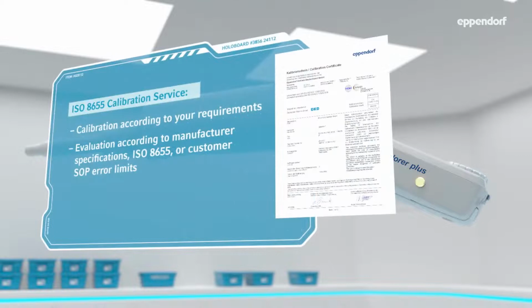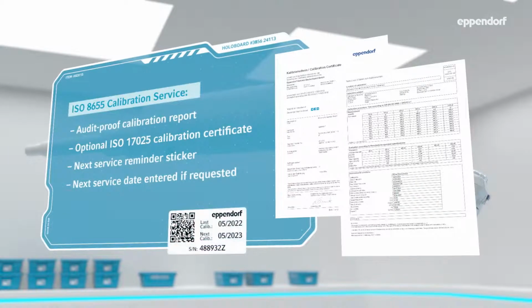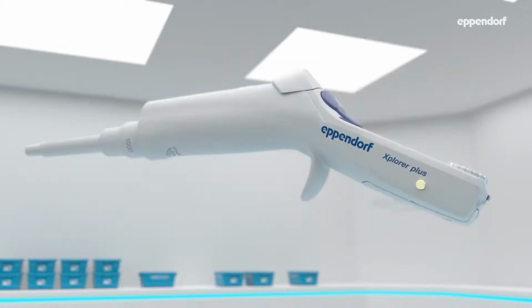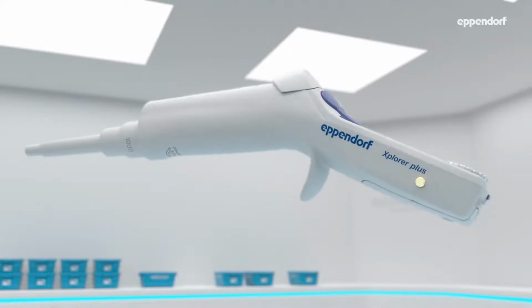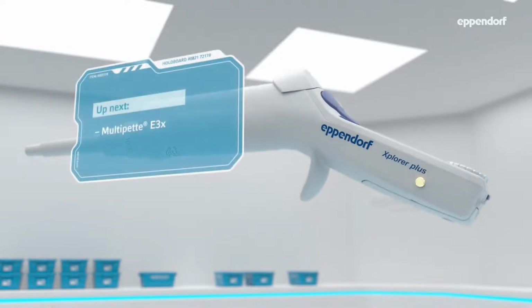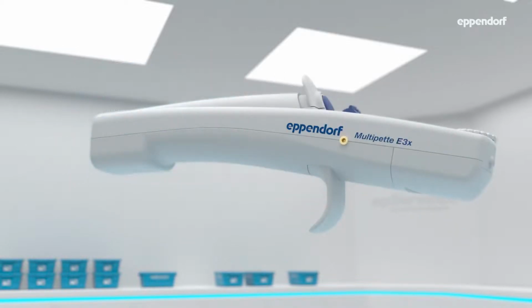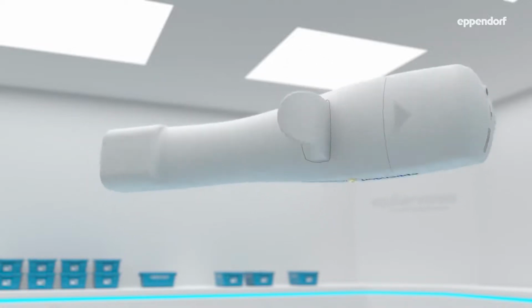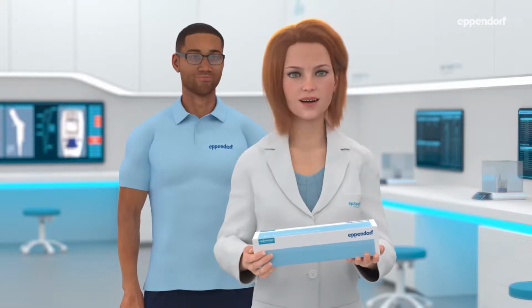This electronic pipette is now ready for calibration. The electronic and software function tests are also applicable for our electronic multipette E3 and E3X pipettes. Here you go, your fully maintained and tested pipette.